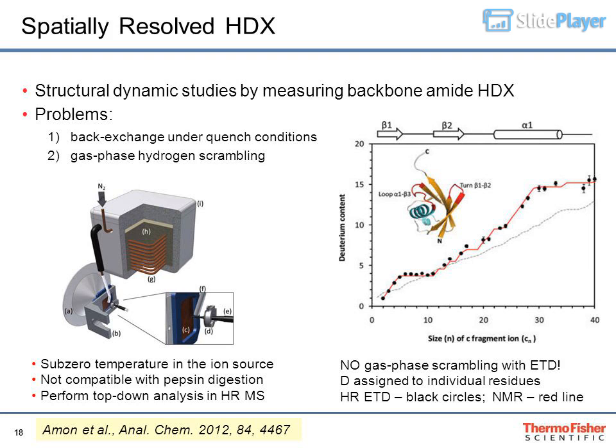The labeled parts are A. Entrance cone of Orbitrap mass spectrometer, B. Holder for ESI chip, C. ESI chip, D. Holder for conductive pipette tip, E. Conductive pipette tip, F. Outlet tubing for cold nitrogen gas, G. Copper tubing, H. Dry ice, and I. Thermoinsulated box. Only the front end parts of the NanoMate are shown.